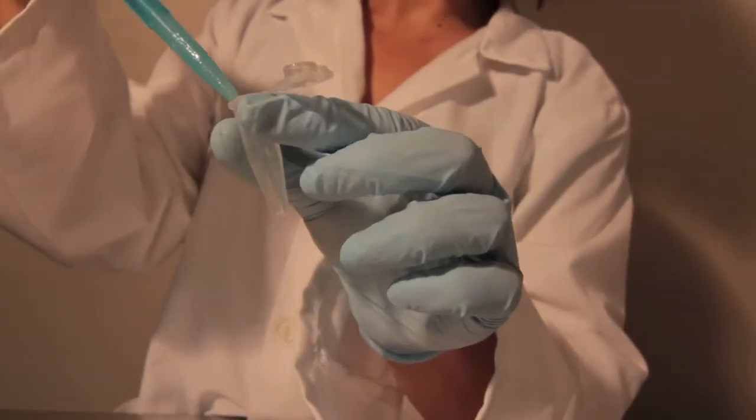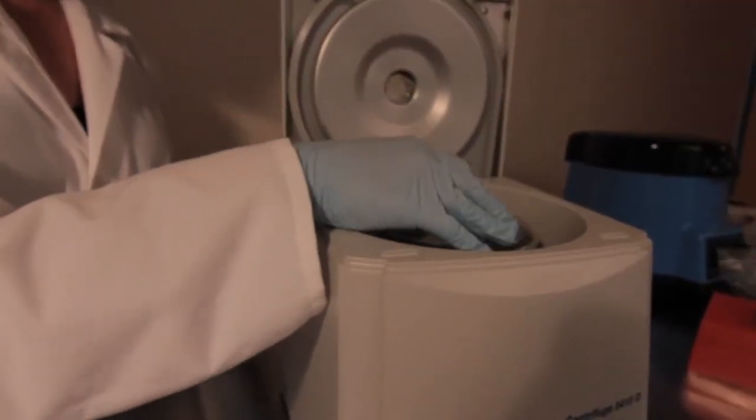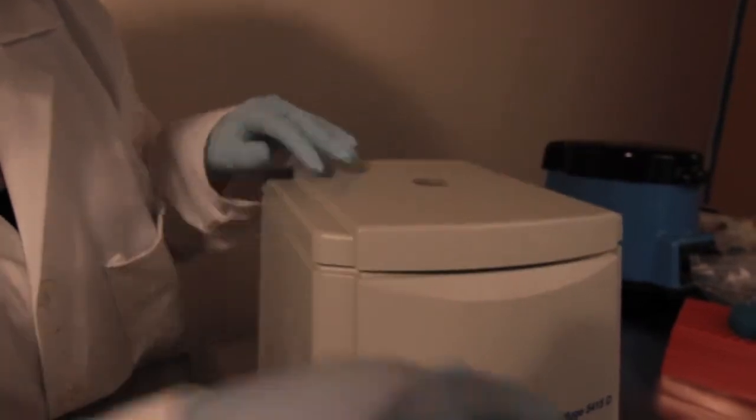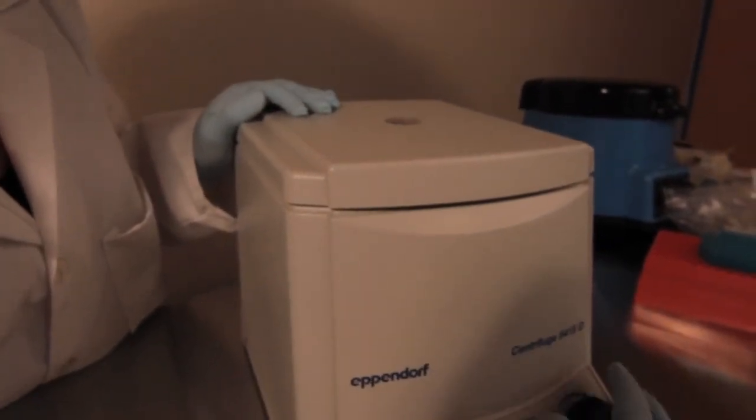First, harvest your cells and spin them down to yield a pellet. If you're homogenizing your cells in 1.5 milliliter microcentrifuge tubes, we recommend that the volume of your pellet be no larger than 300 microliters.